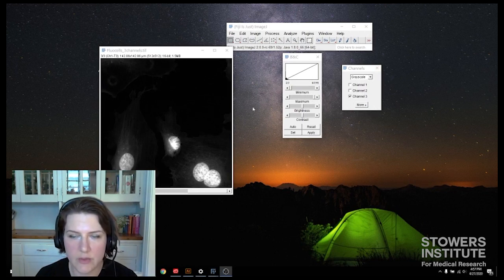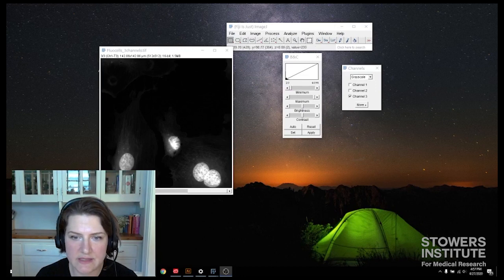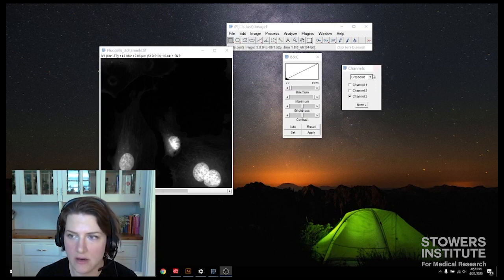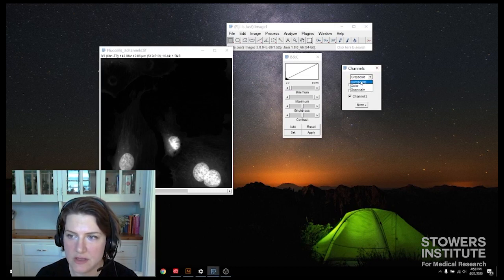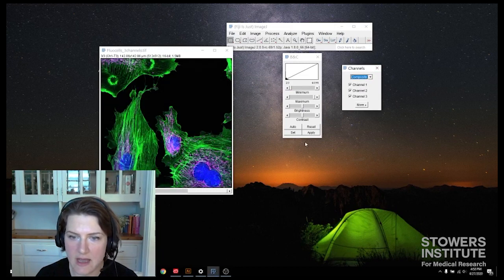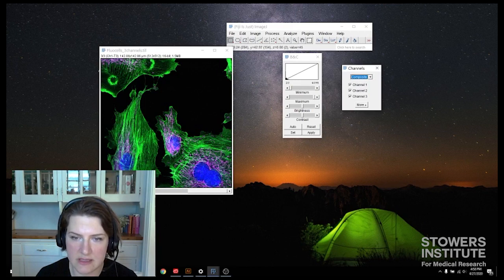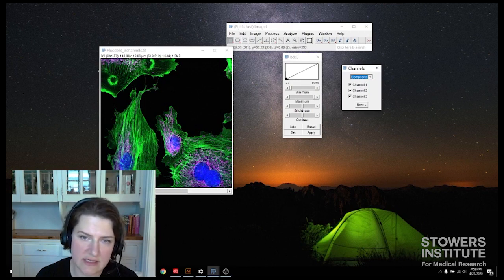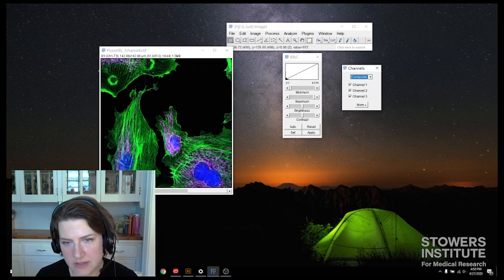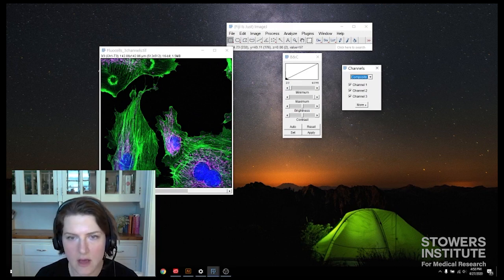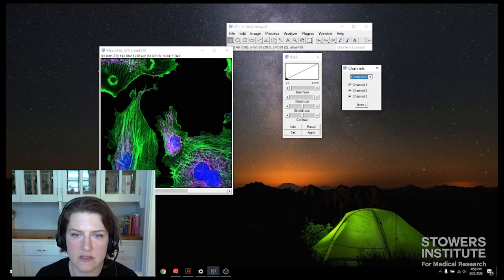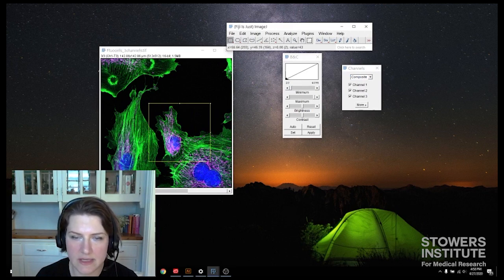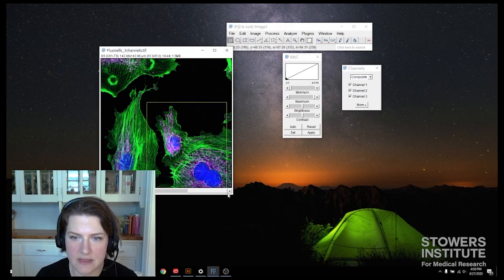Now what we want to do is figure out what area we're going to crop out that's going to be in our figure. So say I'm really interested in this interface between these cells. So I want to focus on this area. And for aesthetic reasons in my figure, I want my images to be square. So to do that, what I'll do is I'll just draw using my rectangular selection tool. I'll draw basically where I want it to be.